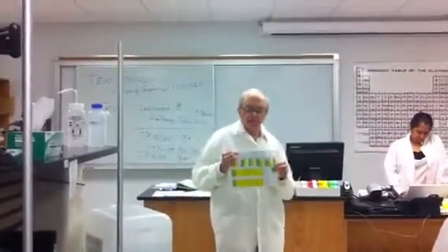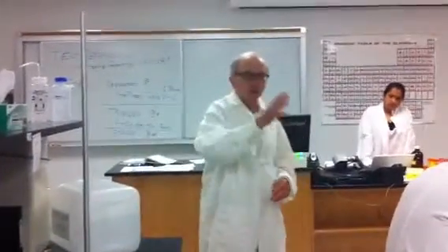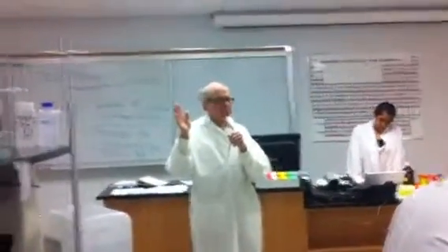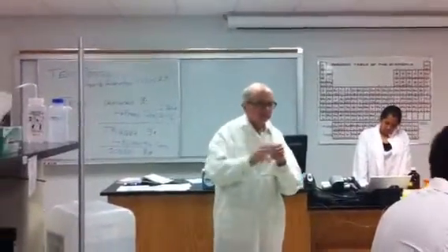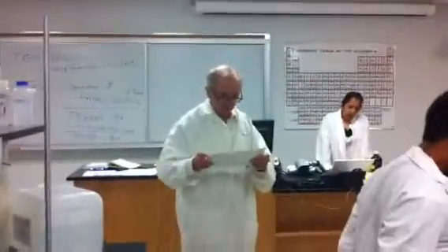Now, may I also advise you that you have to watch these like a hawk in terms of the mixing, because each one of those should be in order of decreasing optical density.